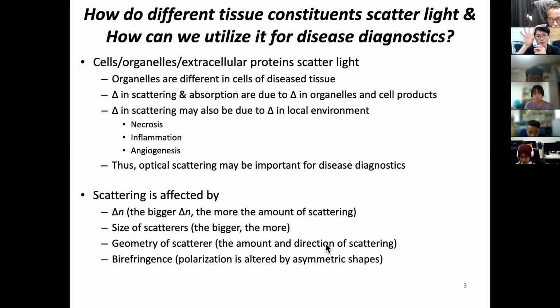The side scattering is more when the scatterers are of a more complicated shape, such as a more lobular shape, more nuclei. Different shapes will create more side scattering. With that information, we can even distinguish between different white blood cell types: monocytes having one single nucleus, and the other kind of white blood cell, granulocytes, having multiple lobules, which will increase the side scattering. So that gives very precious information.